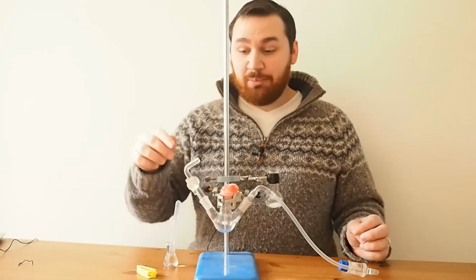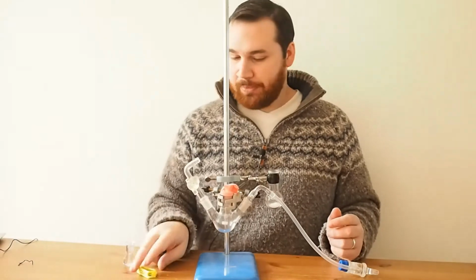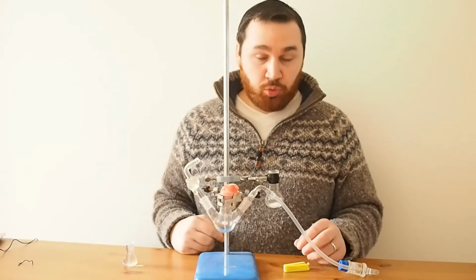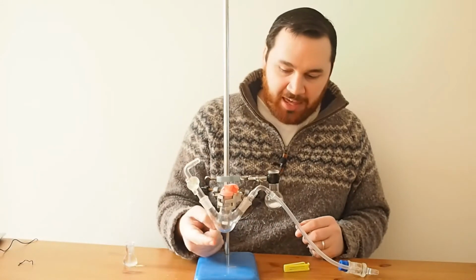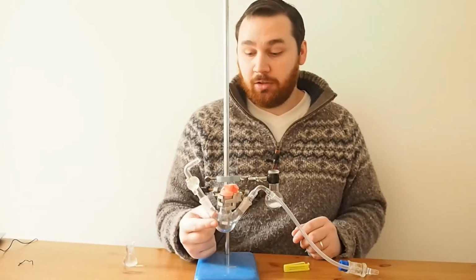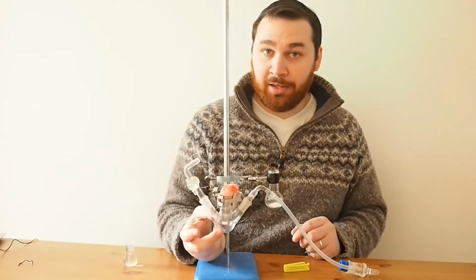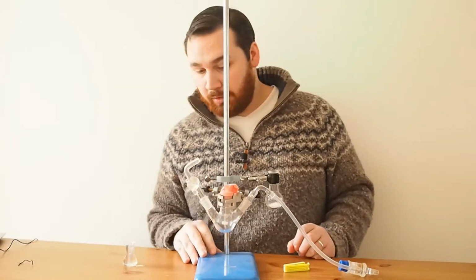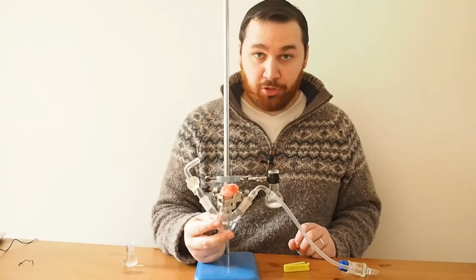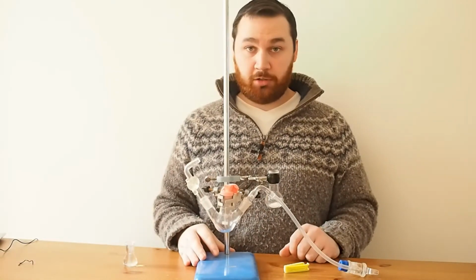And also, I'm using glassware for this because I have it and it's nice and it's useful, but you can easily set this up using bottles and little pieces of tube connecting them, because the area that we're going to make so that it's under an inert atmosphere or under the carbon dioxide is this little chamber here. Now we're not going to do anything particularly risky with that chamber at the minute. We're just going to explore how this apparatus works.